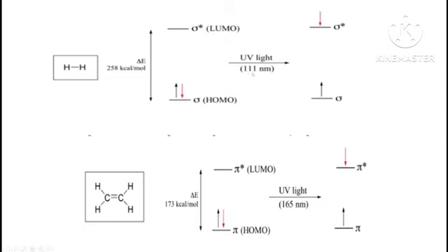So this wavelength of light contains the energy that will enable this pink electron to jump towards the LUMO position. Once we expose this electron to this UV light, it will gain the energy that enables it to jump. As a result, the electron will finally jump towards the unoccupied position. Then you'll be able to calculate the amount of energy that the electron absorbed when you analyze your absorption spectrum, as I explained in the previous episode.